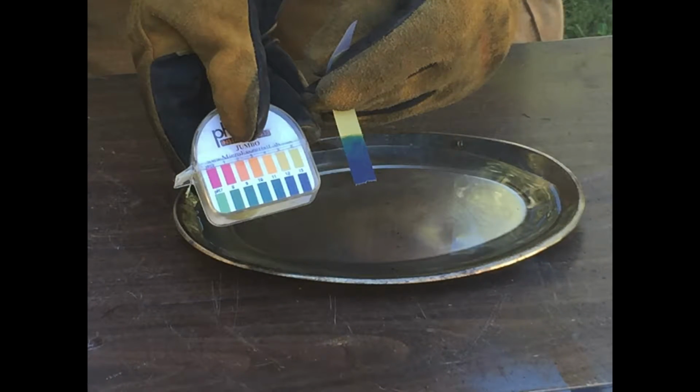The residue of lithium hydroxide left in the pan rates a 13 to 14 on the pH scale, which is considered to be a strong base, as indicated by the dark blue color change on the pH paper.